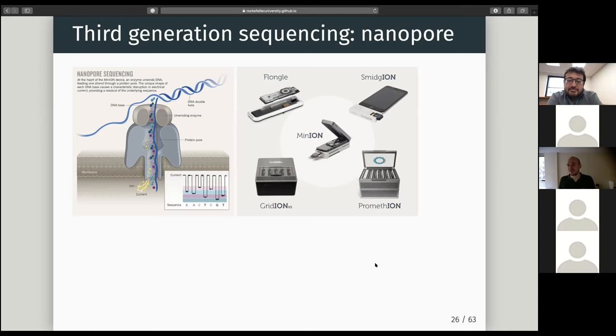I've used PacBio. It's mostly for bacterial genomics projects to try and close bacterial genomes. And probably the reason why I'm attending this course is that I didn't succeed in closing these genomes yet, so I hope I will learn new skills from you guys as well. I've tried a few approaches, also the new approaches that use subsetting of a lot of reads and then doing a lot of different circular assemblies and then combining them to try and close them, like Trycycler. I'm sorry, I said that assembling bacterial genomes is a trivial issue these days, and no offense intended. Yeah, it depends on what the bacteria are, maybe. That's why I'm here.